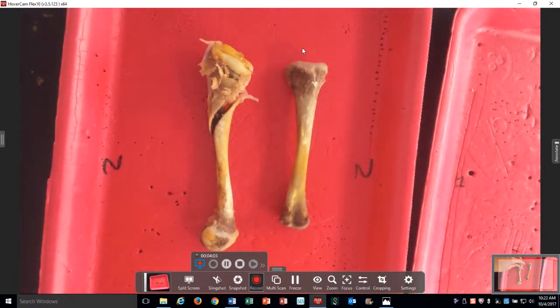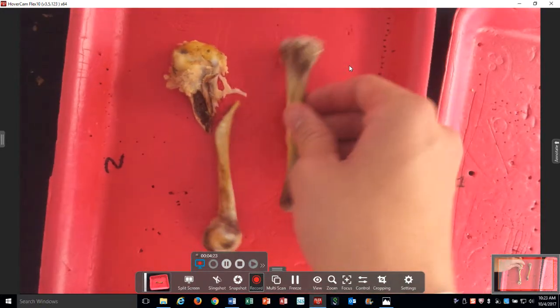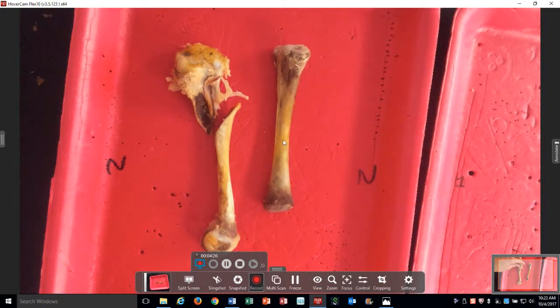What we're going to do is make a cut like that — what type of section would that be? Midsagittal. Now I'll rotate it so I can see a lateral view. If we do this cut instead, what are we doing now? Not a midsagittal, but — frontal-coronal. So I'm going to have half the class do it one way and half do it the other way, and then we should be able to see and identify the marrow.